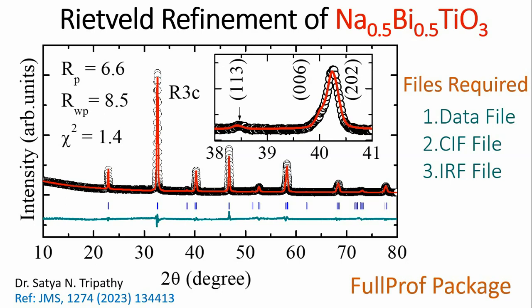Hello students. In this video I am going to demonstrate how to do the Rietveld refinement of sodium bismuth titanate using the FullProf package. Sodium bismuth titanate is a ferroelectric material. It has tremendous application in energy storage devices.